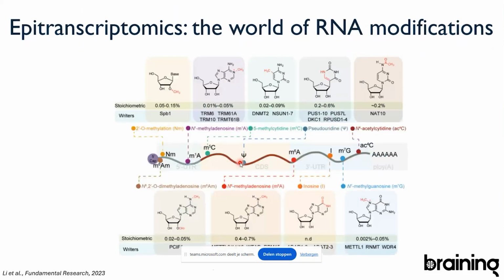A second application that is more in the realm of fundamental research is if we want to look at epitranscriptomics. I think most of you have heard of epigenetics, but maybe not so many of you have heard about epitranscriptomics. However, it is very analogous to epigenetics: where epigenetics are modifications of the DNA without altering its sequence, epitranscriptomics is the study of RNA modifications.